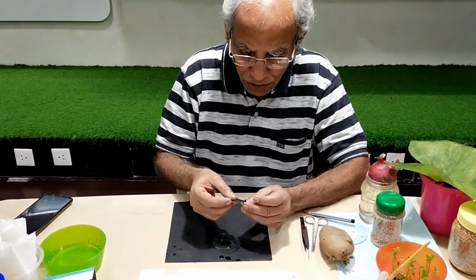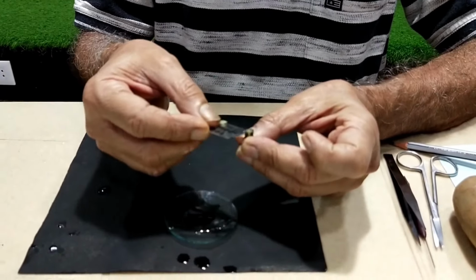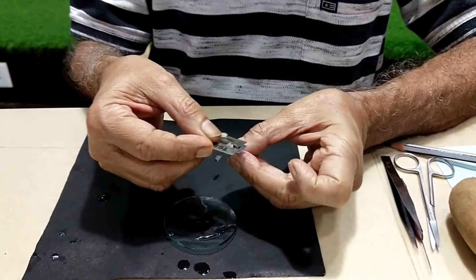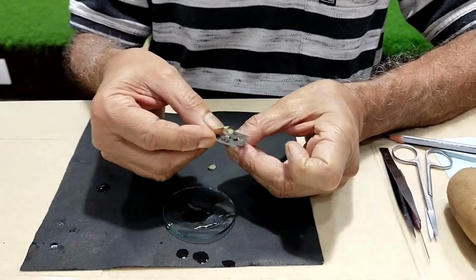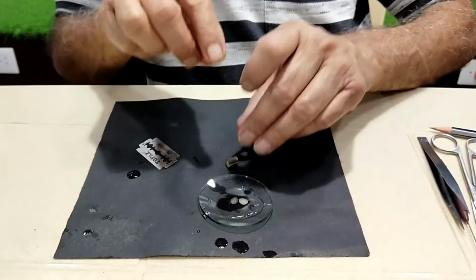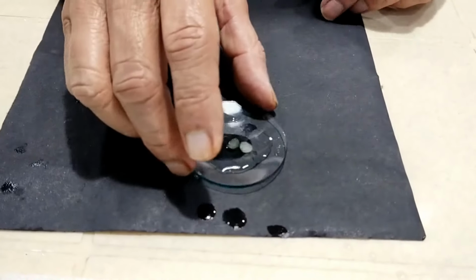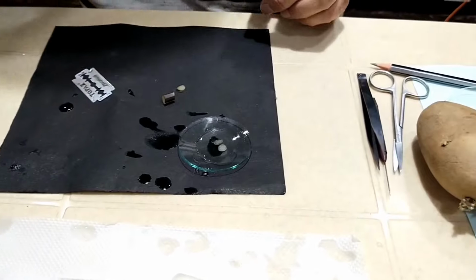I'll take some sections. Okay, I think I can select this one and I can make a slide out of it. They can be still thinner, but it should be okay.